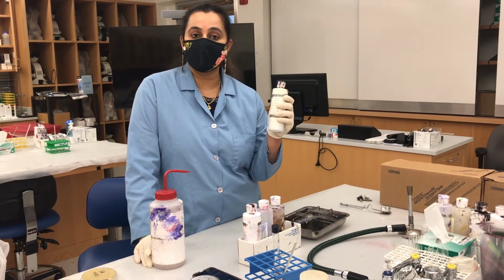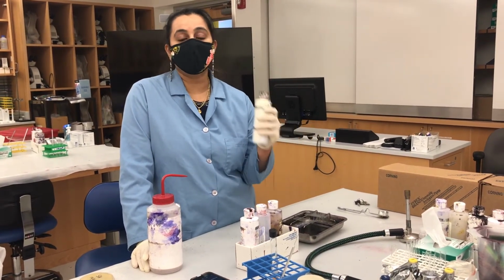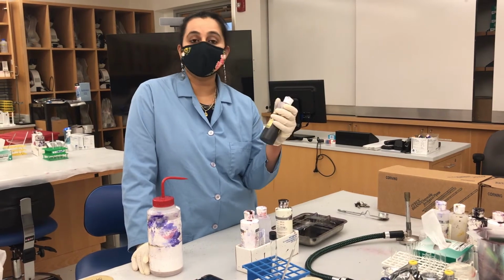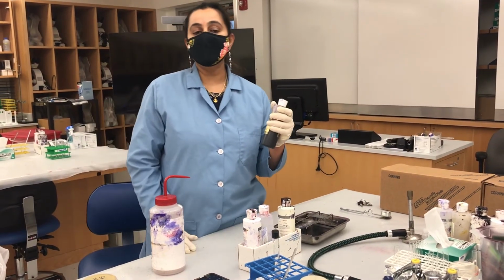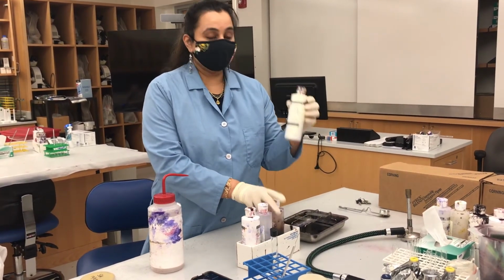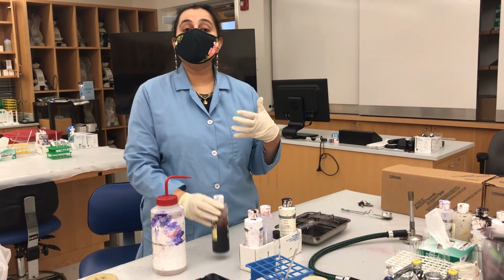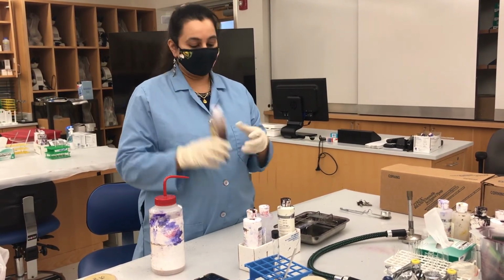So once you add your primary stain, all the cells, whether they are gram positives or gram negatives, should be stained purple. Okay? And then you add Gram's iodine as a mordant. So what does a mordant do? A mordant is added so that the primary stain sticks to the membranes of the cells really well. It forms a complex with the cell membrane, and it keeps the dye inside the cell better. That's the reason we add mordant.